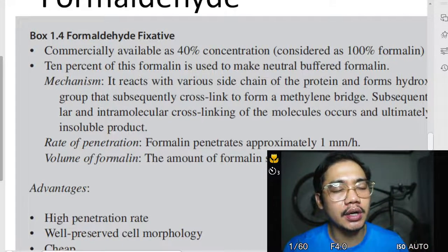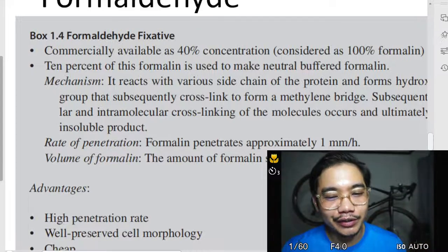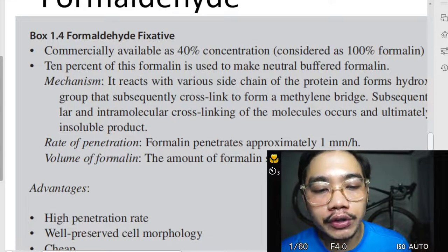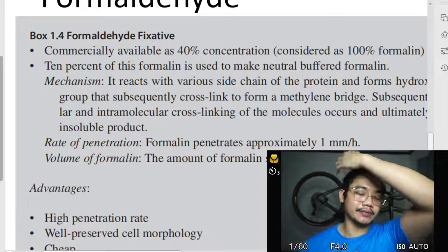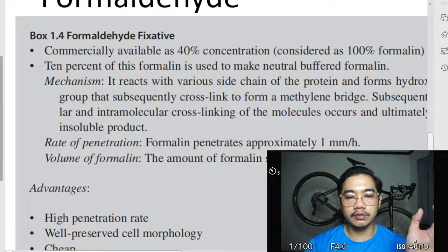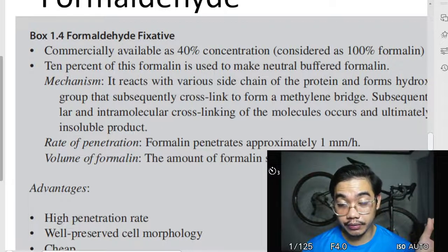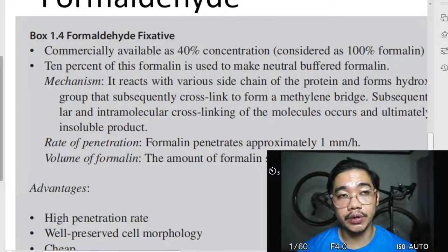Formalin is the gas-infused water, no? So mao na siyang 100% formalin, which is 40% formaldehyde. Gets libog, mind blown, no? So kung mag-ingon sila na pure formaldehyde, excuse me, no? Formaldehyde is gas in its purest form. Maybe you mean 40% formaldehyde, which is 100% formalin.